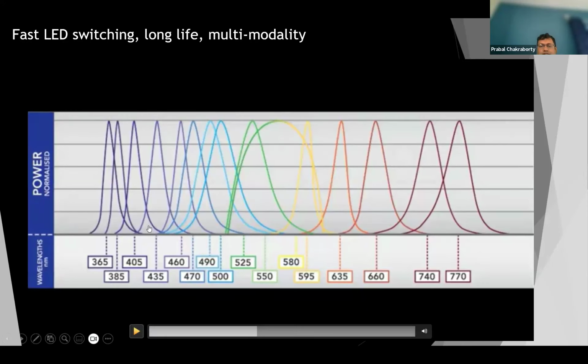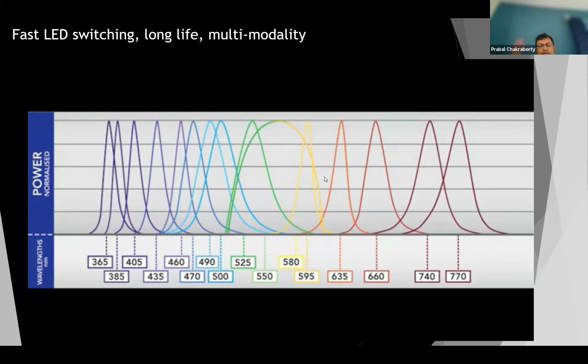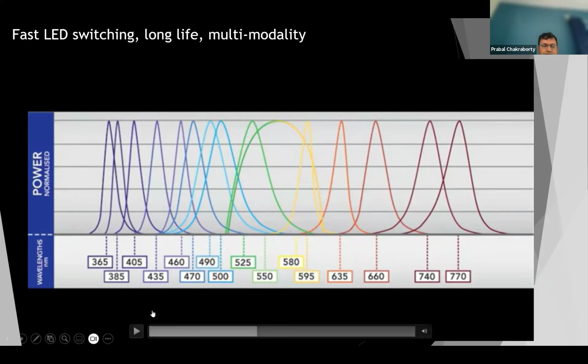So you can see there are 16 LEDs, and each LED's excitation is mentioned here. And you can use any LED, like four groups are there. You can combine any LEDs of these four groups, and then you can do the imaging with these four colors.